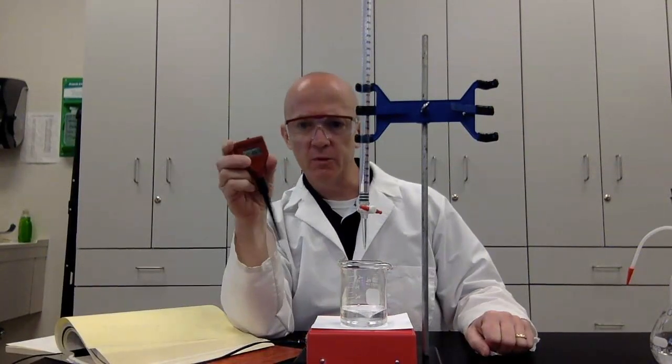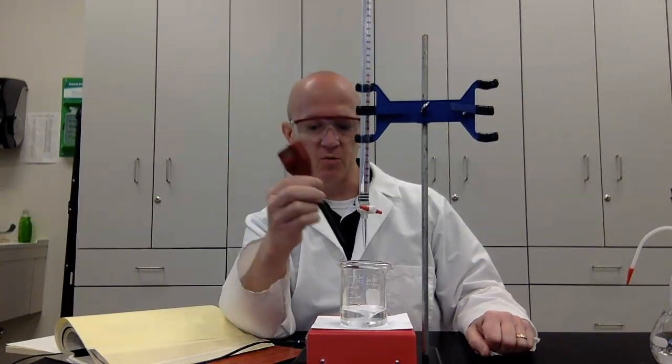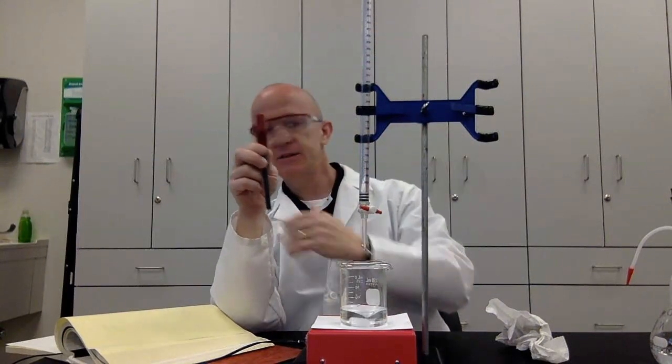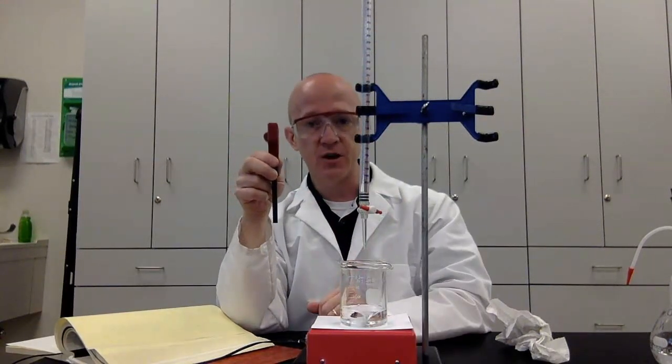If you want to get really, really precise, you can use one of these. This is a pH meter. And when you leave this pH meter submerged while you're doing the titration, you can add a little bit and then take down a reading. Add a little bit more and take down a reading. And from it, you can get an actual graph of the titration.